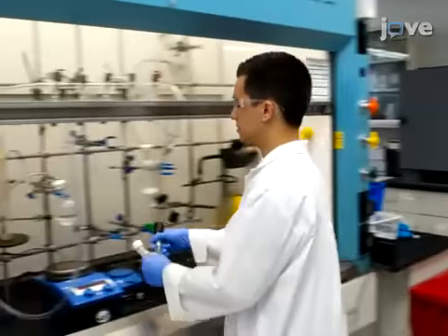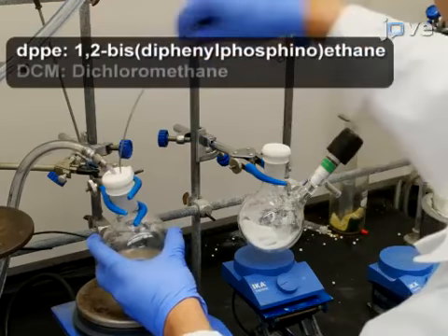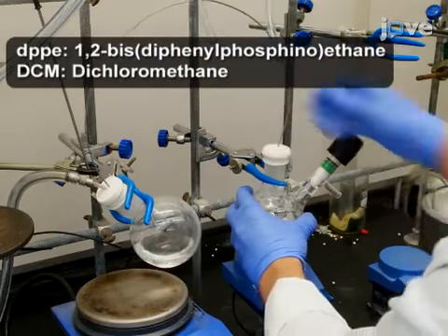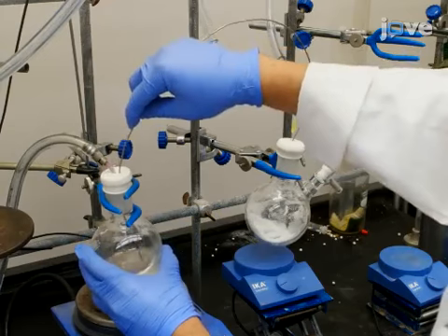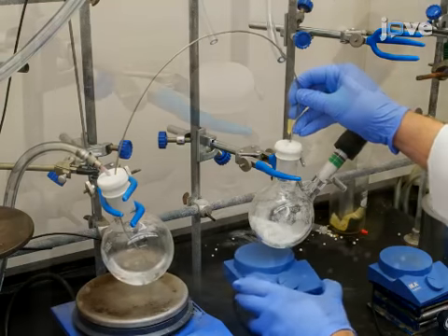To begin this procedure, dissolve 1.00 grams of DPPE in DCM under inert gas. Prepare reagents as outlined in the text protocol. Then, add 40 milliliters of anhydrous degassed dichloromethane to a 250 milliliter Schlenk flask equipped with a rubber septum.